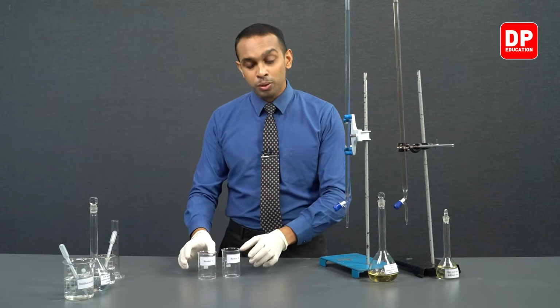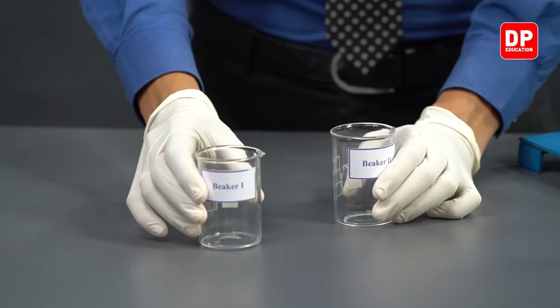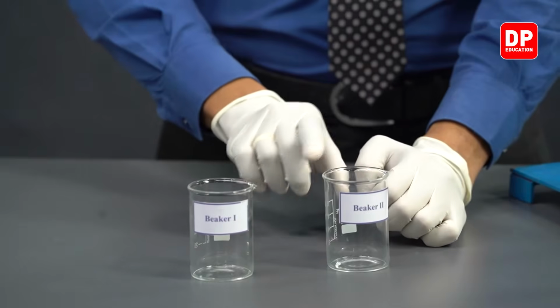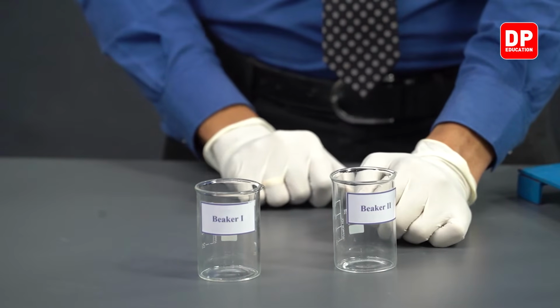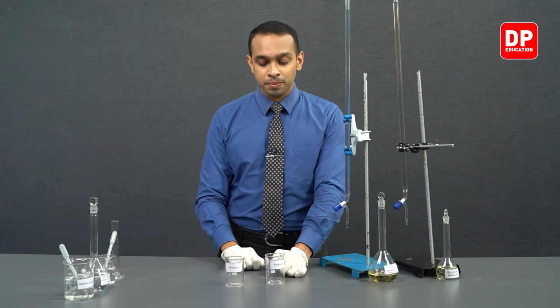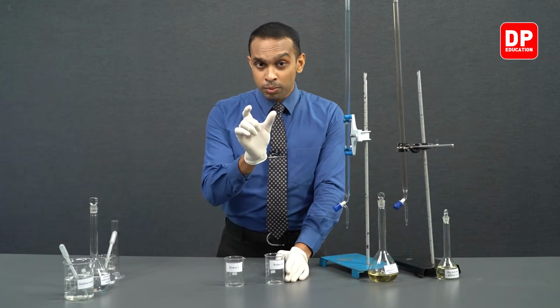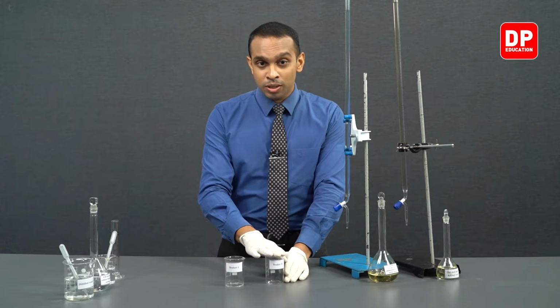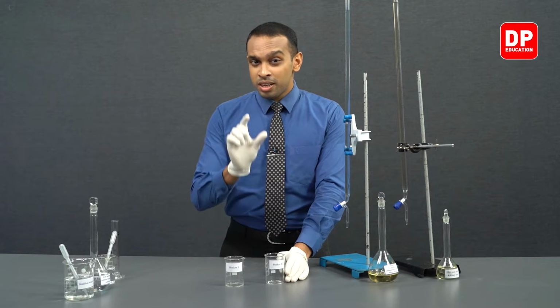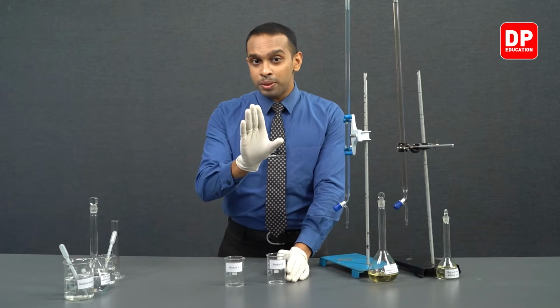So what we are going to do in this experiment, we are going to take to beaker 1 Fe3+ ions, and to beaker 2 we will be taking potassium iodide solution along with thiosulfate ion solution. So we are going to measure a very specific amount of sodium thiosulfate into this. In each of the experiments we are going to be doing from now onwards, the amount of sodium thiosulfate we take into this beaker 2 will be the same.